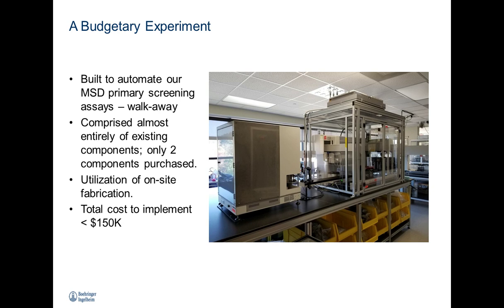We also utilized our site fabrication shop, which does, amongst other things, metalworking, to create an enclosure on the Liconic hotel, which is featured in the foreground of the picture here. Since MSD assays are light sensitive and incubation is going to be taking place inside this hotel, we needed an enclosure with an access door to go on the hotel. And our fabrication shop here on site at BI was able to do this for us at almost no cost.